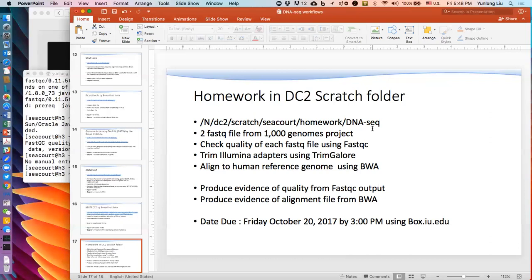Two, you've heard a lot about the 1000 Genomes Project. It's time to let you start looking at actual data. I could have given you a setup established. I know this is going to work. This is going to be easy, but I would be robbing you of your graduate school experience. And I want you to actually deal with real software that's being used in real pipelines here at the School of Medicine and around the country, around the world, actually.